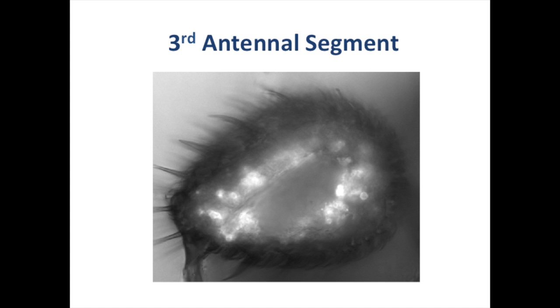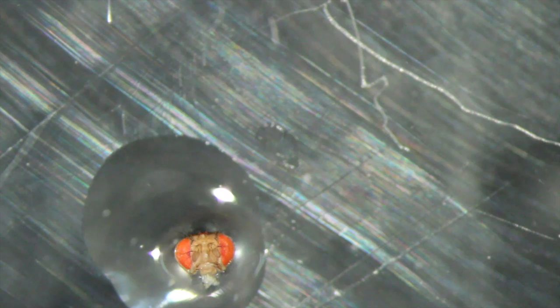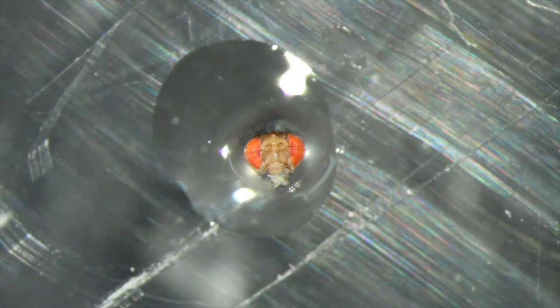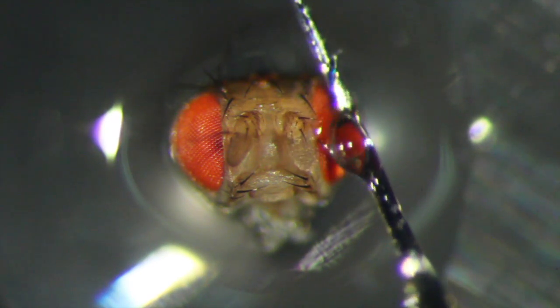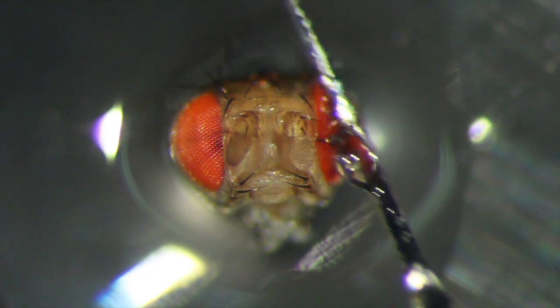Next, we show a variant of the procedure to open the third antenna segment without covering the olfactory sensilla. Place a droplet of resin on a Petri dish lid, then place a head removed as in the previous section on the drop and allow it to sink so that just the sides of the head are covered. Turn on the curing light for 10 seconds. Take a very small drop of resin and apply it to the lateral edges of both antennae. Cover the head with a drop of water and cure for 1 minute.